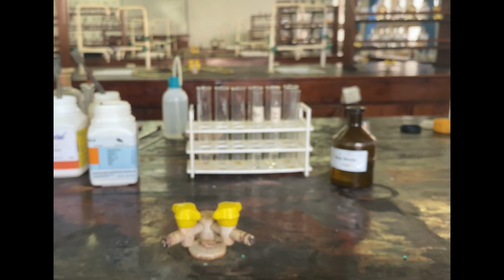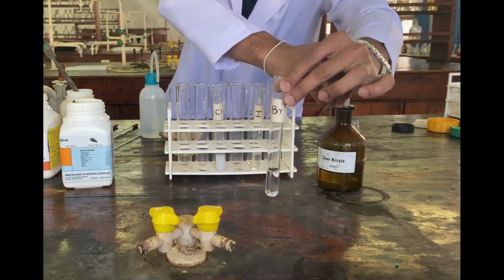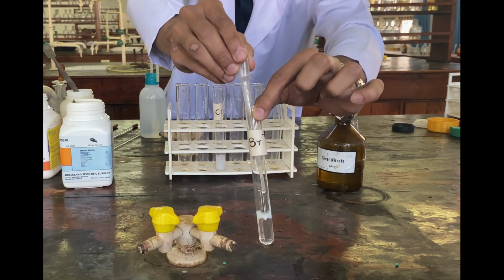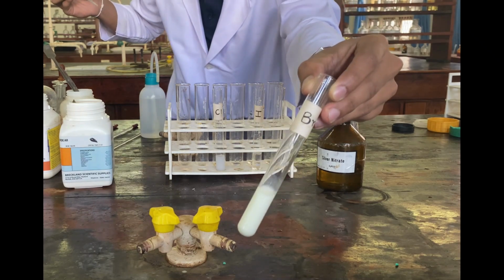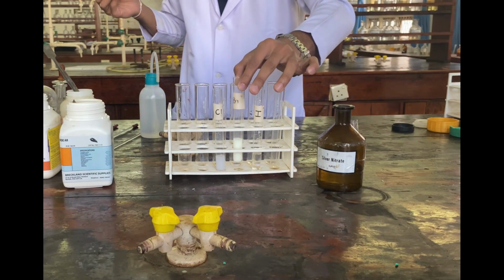Next, add a little bit of silver nitrate to the second test tube and notice that it turns a bit of darker color than in the case of chloride. We call it cream color. This cream color is due to presence of silver bromide.